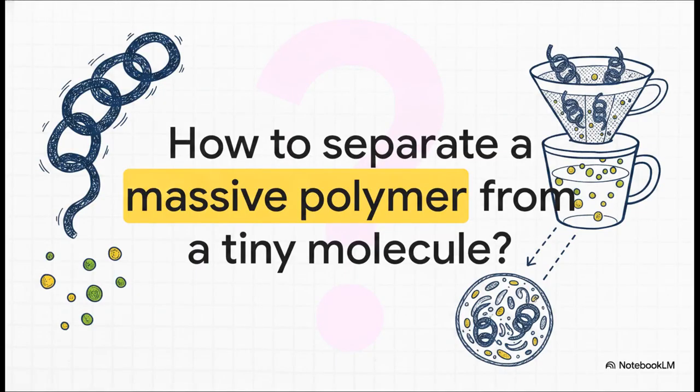Okay, so here's the fundamental problem to chew on. How exactly do you separate a massive biological polymer from a tiny little molecule? Like, if you picture a coffee filter or a sieve in your kitchen, your physical intuition probably screams that the big stuff gets stuck in the net, right? And the tiny stuff just slips right through? Well, that makes perfect sense in our macro world. But down in the microscopic realm of analytical chemistry, if you rely on that everyday logic, you're gonna get the results entirely backward. To solve this, we actually have to look at a highly specific type of separation where the rules of the race are totally flipped.